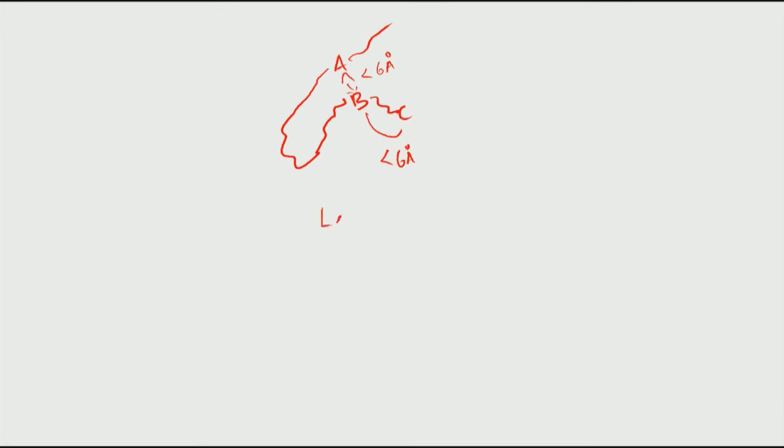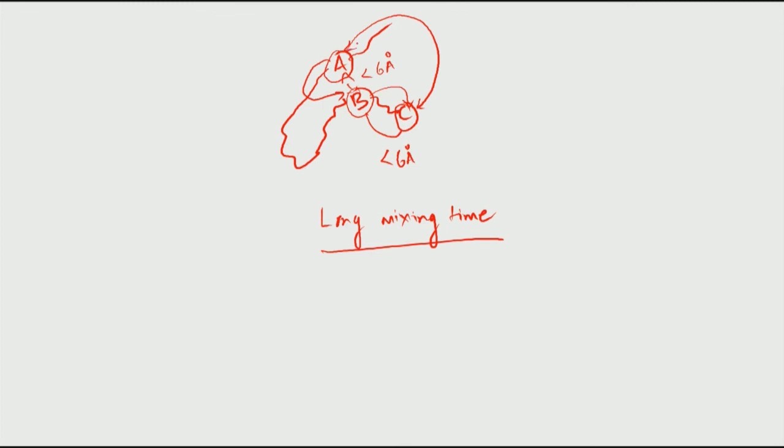But if I use a long mixing time, the polarization from the first gets transferred here because of the standard NOESY effect. From here it gets transferred to this side, in the same mixing time. Therefore, I may start seeing a cross peak between these two atoms because of this intermediate B. This is similar to what we saw in TOCSY, the intermediate J coupling.